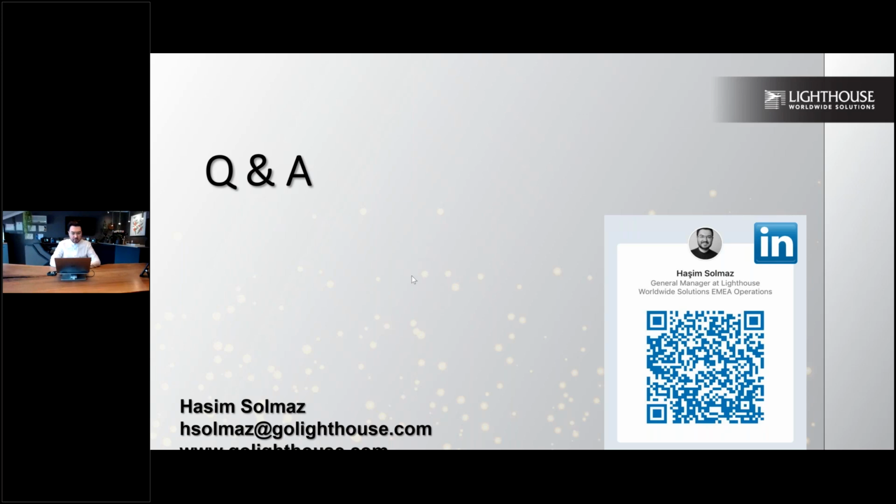During classification of LAF, should I work with 0.5 and 5? For classification, according to GMP, it's 0.5 only because it's a grade A. LAF is under grade A conditions. But if you want to align with ISO and GMP at the same time, I recommend you take 0.5 and 1 micron because for ISO, you can classify this area with 0.5 and 1 micron as well. But keep in mind, you can have your 5 micron limits in your contamination control strategy document if you still believe that the 5 microns are quite critical for your operations within the LAF. So seeing these numbers is critical.